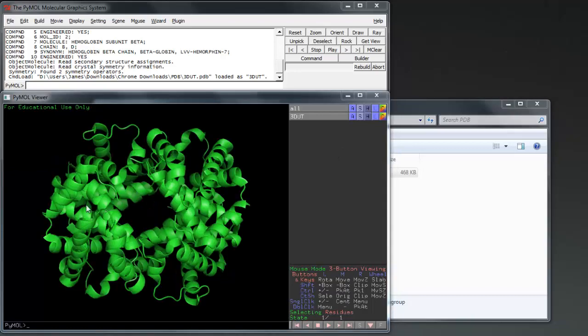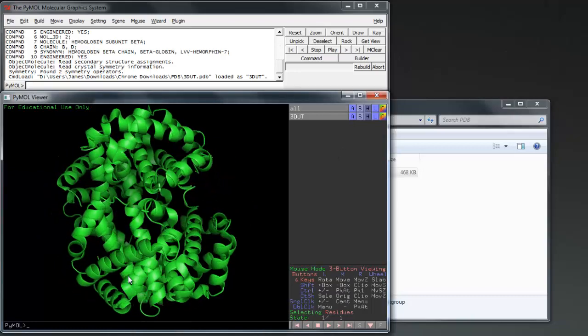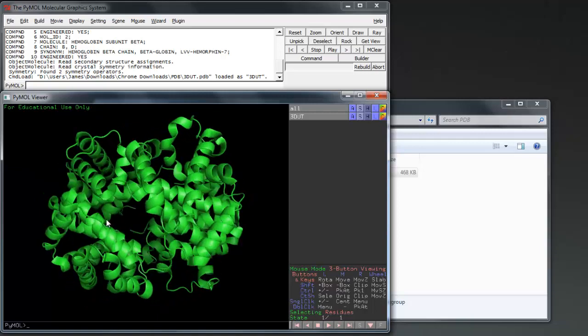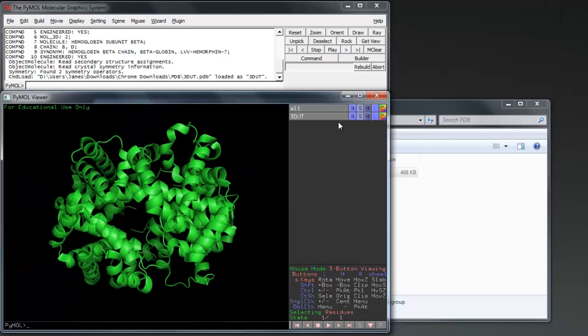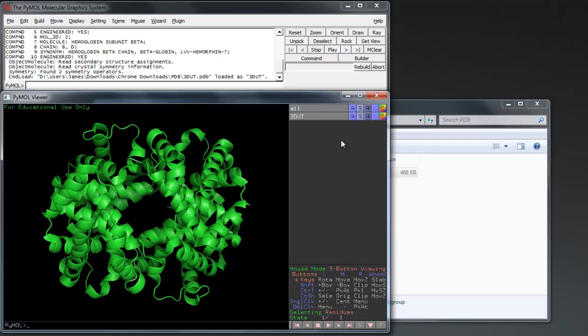Take a look around your protein using the mouse controls I talked about before, bearing in mind you are actually moving the camera, not the object. If you lose perspective of your protein, simply go to Action and Orient to reset the camera to the object.